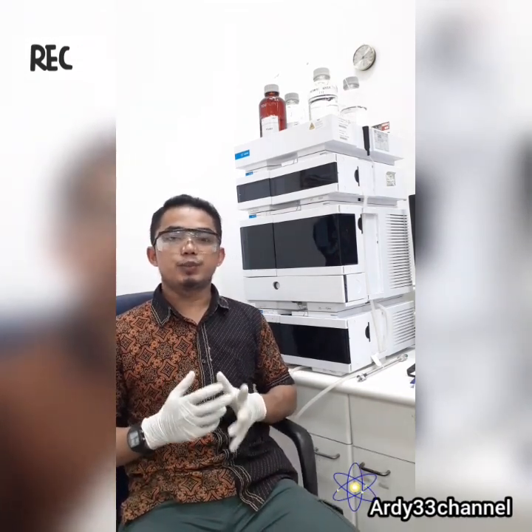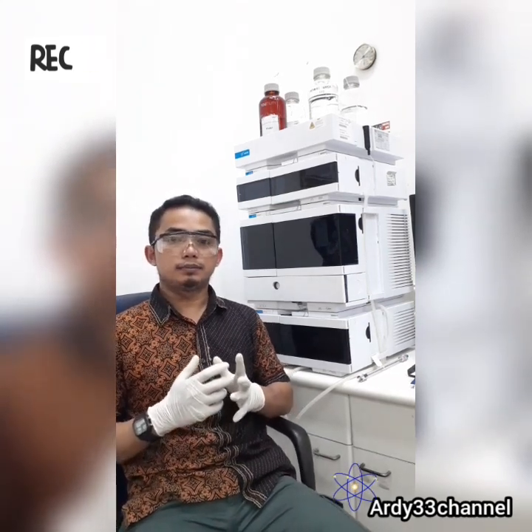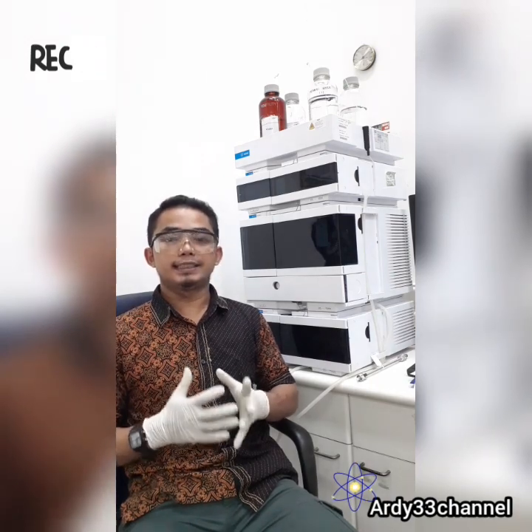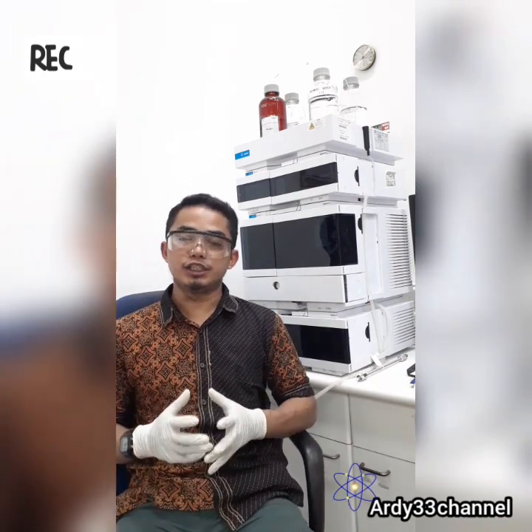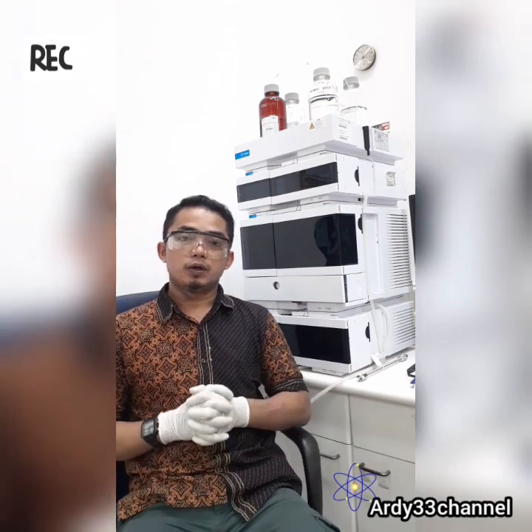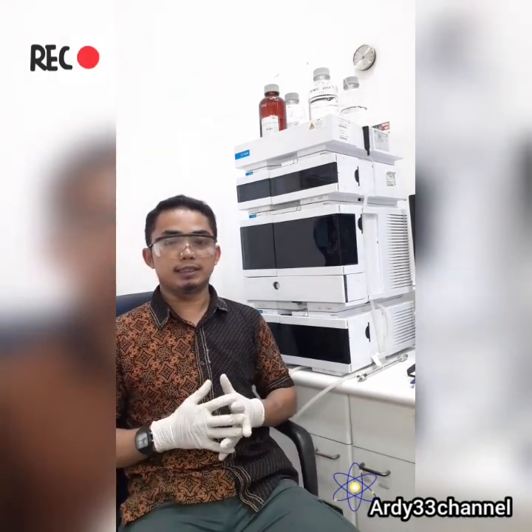Number 3, HPLC does have low sensitivity for certain compounds, and some cannot be detected as they are irreversibly absorbed. And number 4, volatile substances are better separated by GC chromatography, not with HPLC. Okay, this is the advantage and limitation for HPLC system.